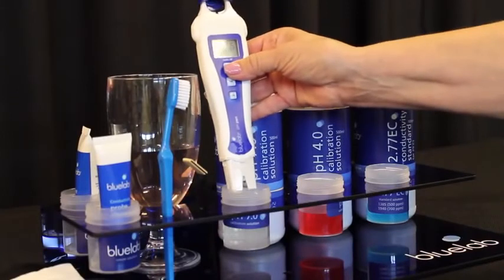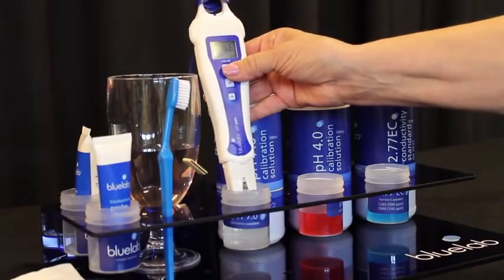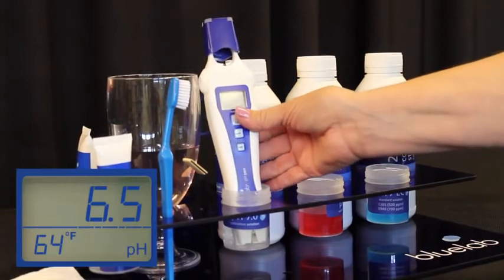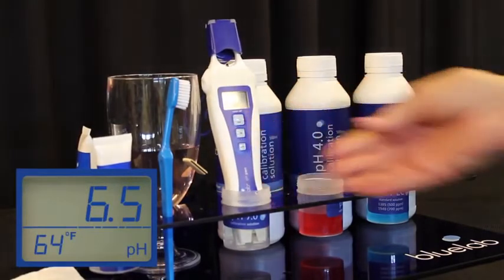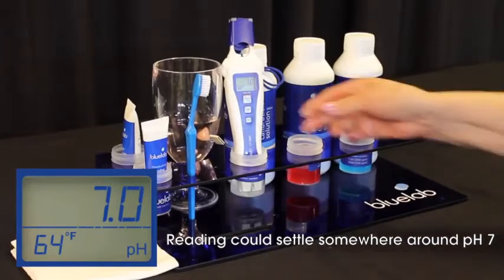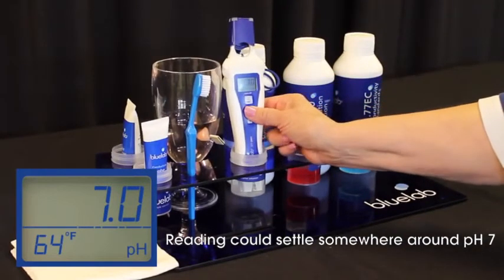Now you're ready to calibrate. Place your pen in freshly poured Bluelab pH 7.0 calibration solution. Wait until the meter stabilizes — this may take a minute or two. Once the reading has stopped moving for at least 30 seconds, you're ready to proceed.